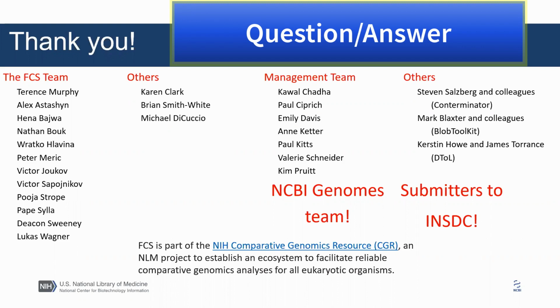Okay, thank you. Another question, and this one is relevant for prokaryotic assemblies. For the phage components, where they're prophage in the bacterial genomes, how does the contamination screen handle that, or is it just for eukaryotes? Oh, that's an excellent question. And it is something that we will encounter with eukaryotes too, in terms of lateral gene transfers. So we're currently working on developing a way to handle these cases.